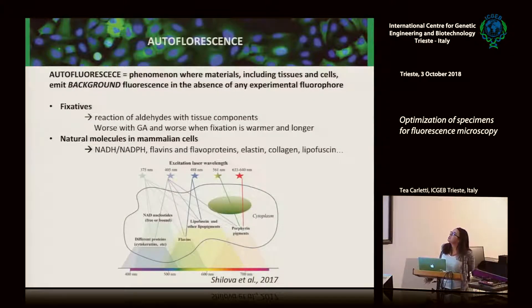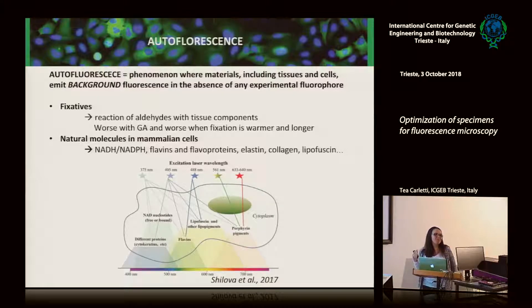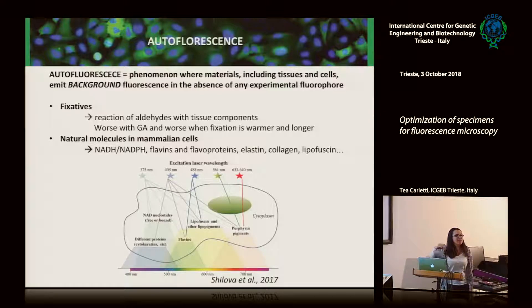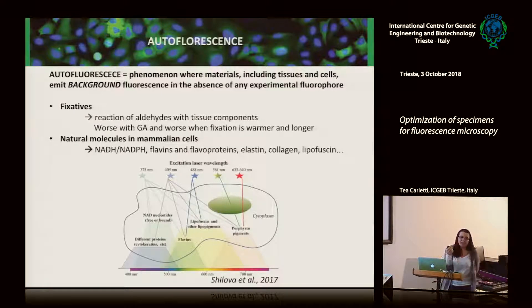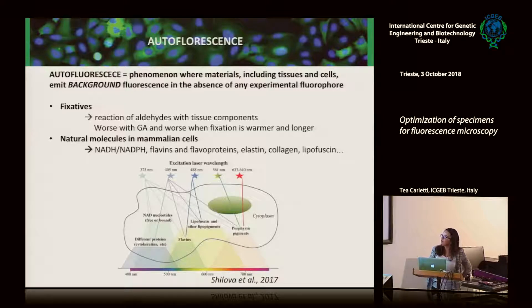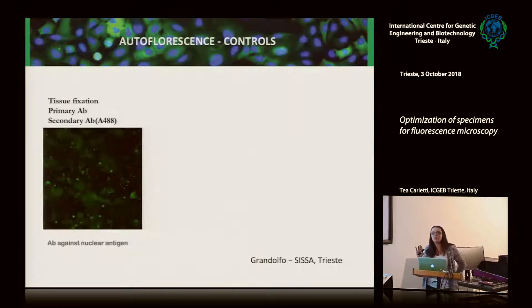Autofluorescence is a phenomenon where materials — including tissues and cells — emit background fluorescence in the absence of an experimental fluorophore. Natural molecules in mammalian cells can emit some fluorescence. Importantly, your fixative can induce autofluorescence because of the reaction of free aldehydes in your samples. What you can do to check autofluorescence is work with controls — always have controls. I took this slide from Grandolfo's lesson last year: a student showed her tissue fixed and treated with a primary antibody against a nuclear protein and then a secondary antibody.